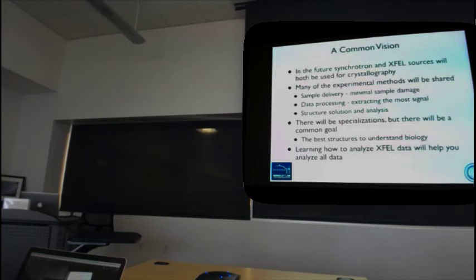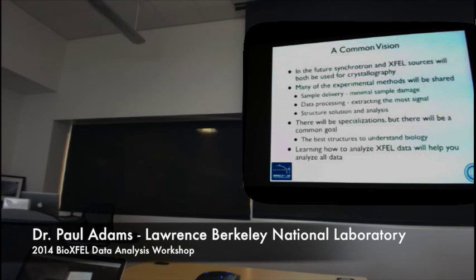So I think there will be specializations in terms of what experiments we do at what sources, but there will be a common goal, which is really getting the best structures to understand biology. That's what we want to do. Right? So I would say that learning how to analyze FEL data like we're doing here is something that will help you really analyze all kinds of data in the future. So I think that's a very good thing to be doing.